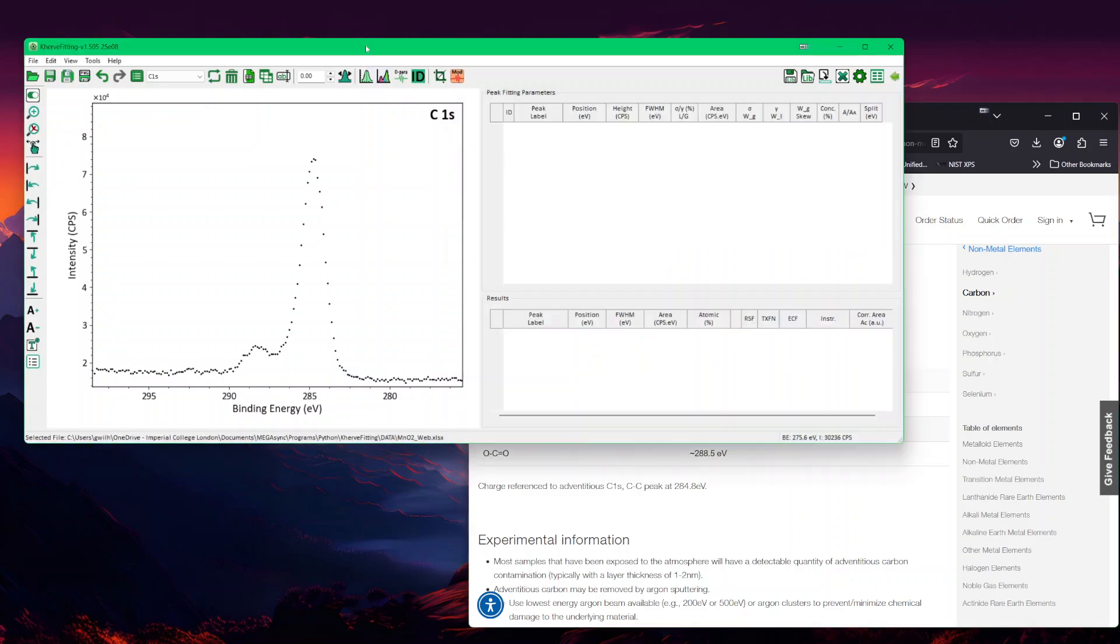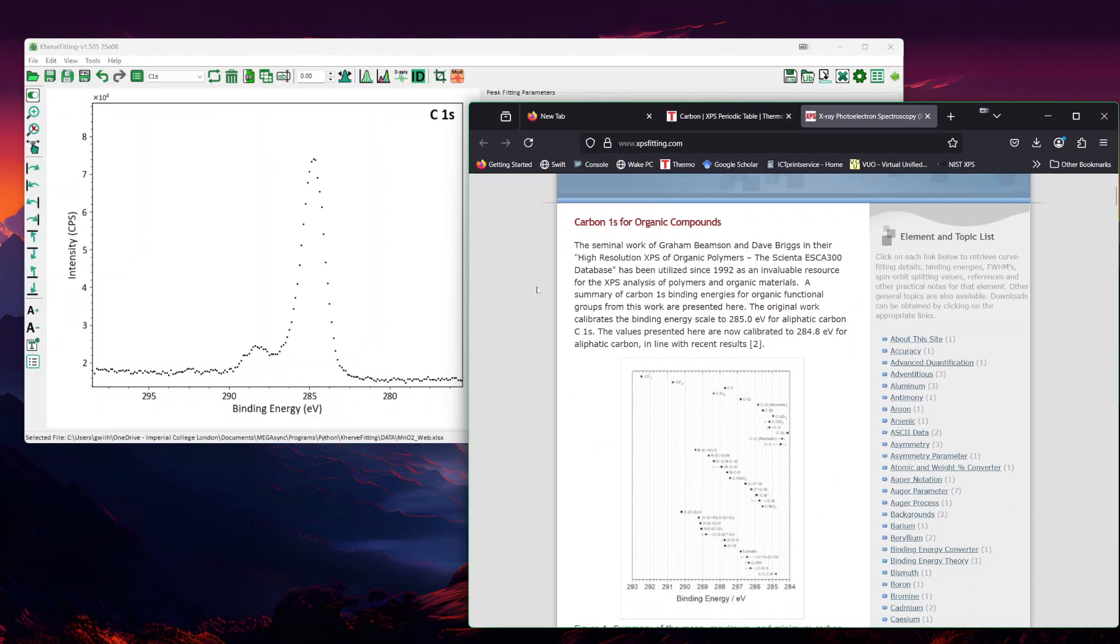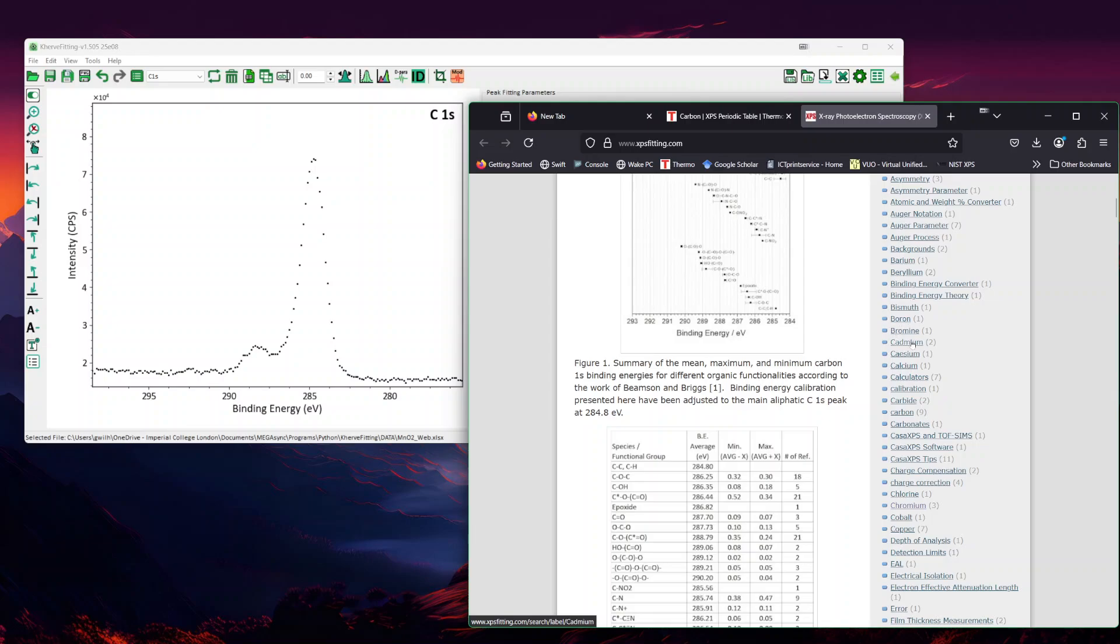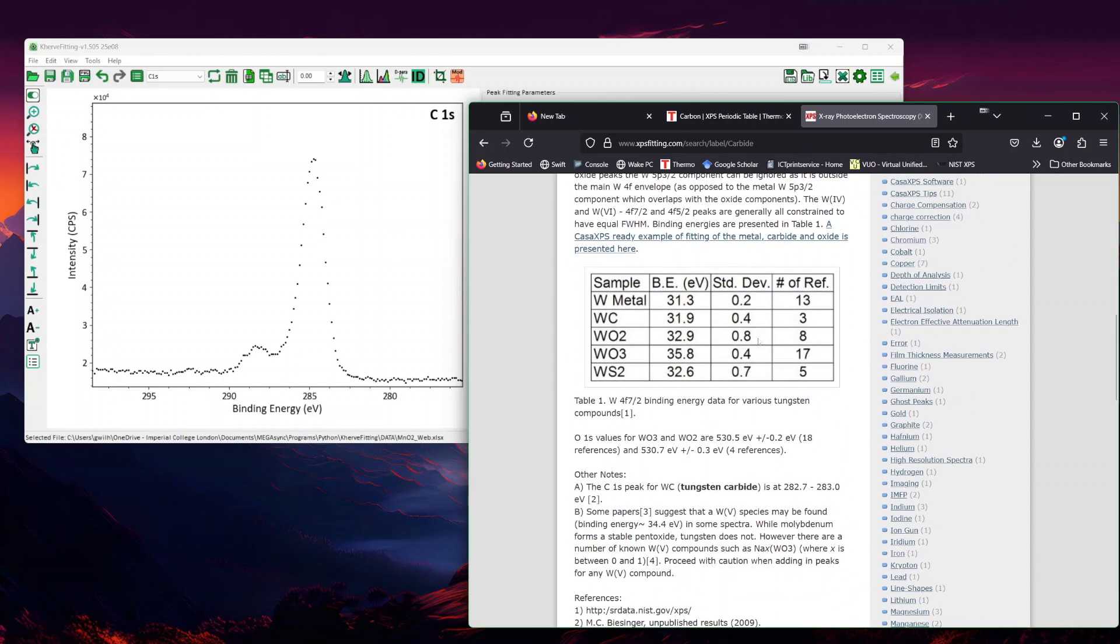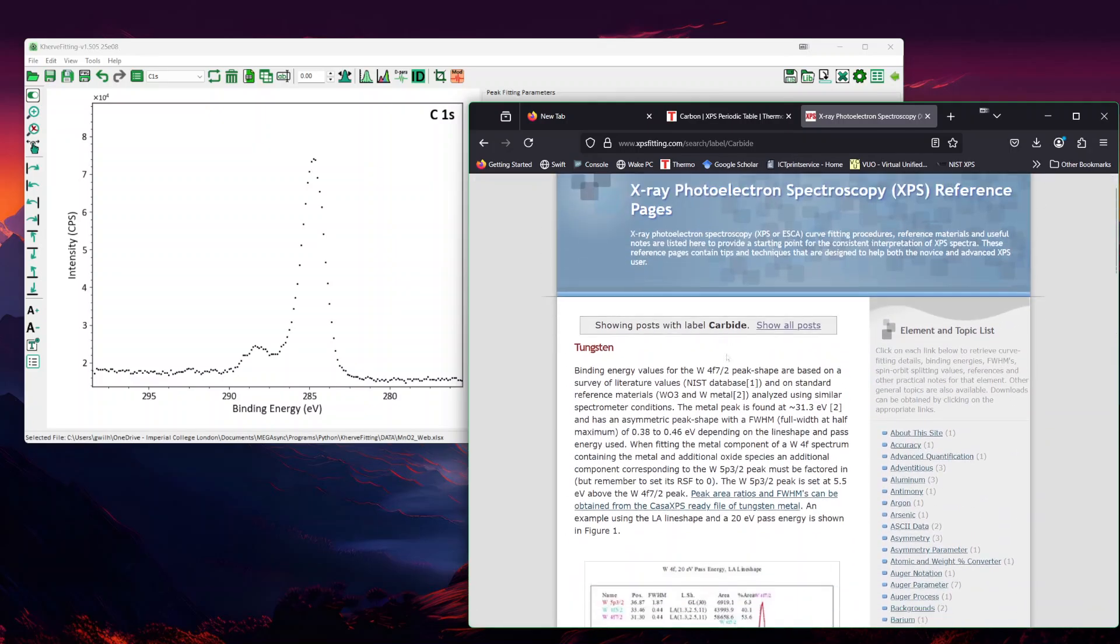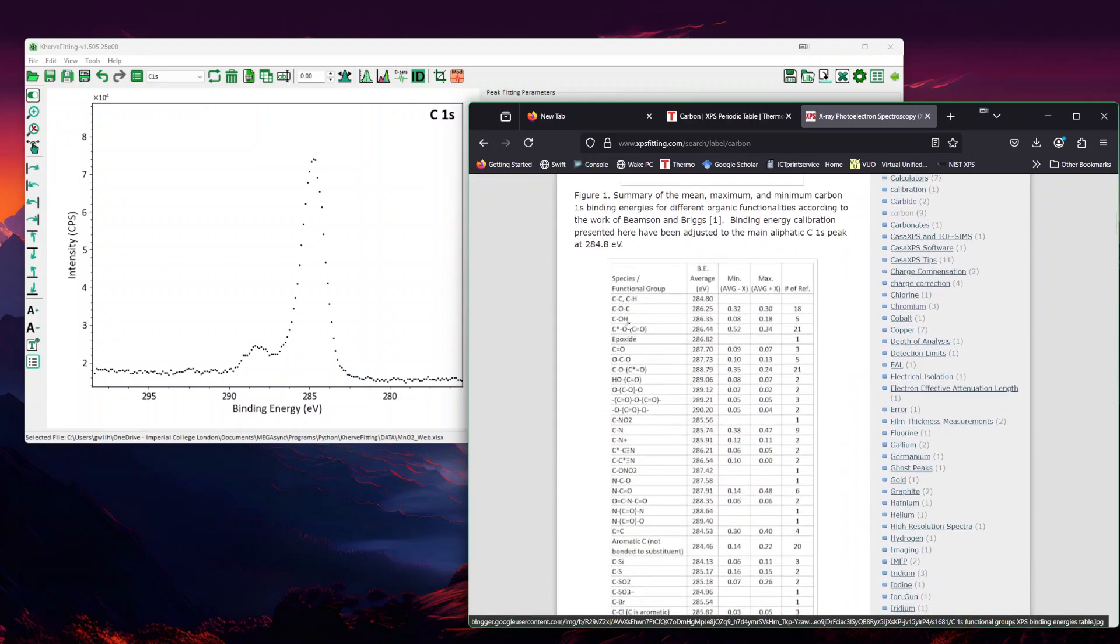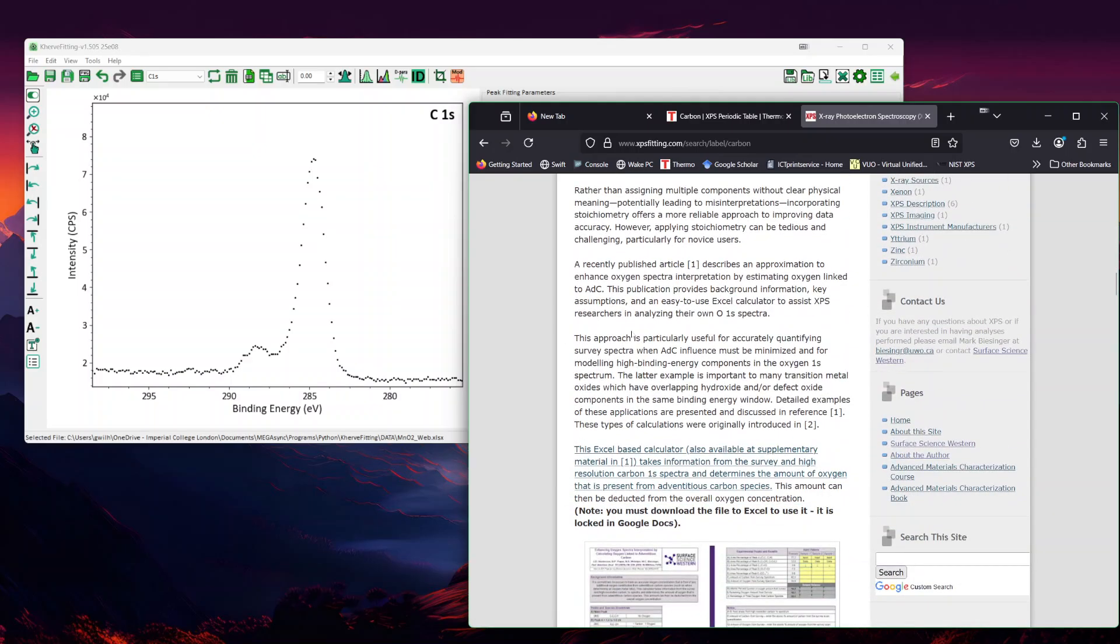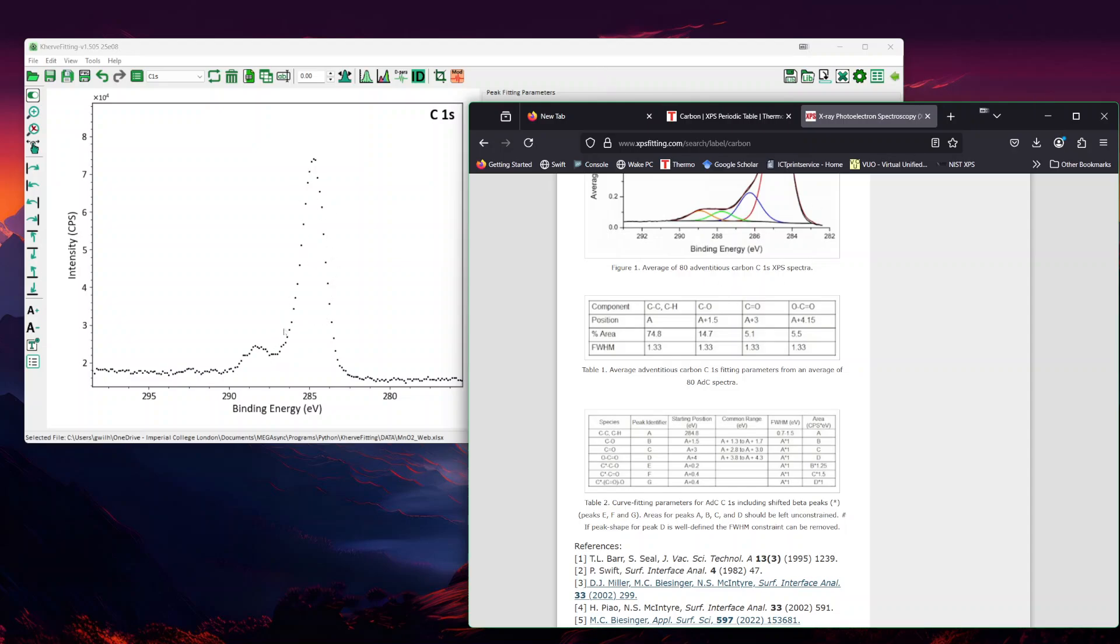Another website that's also good to go to is the one made by Mark Biesinger, which is the XPS fitting. There will be a very nicely made website where you can go into carbon and then look into some kind of peak table for carbon. We have slightly more species and you also get a peak table, which will be shown here.